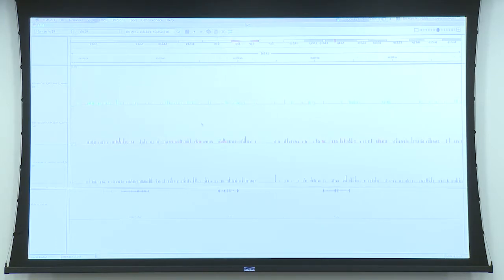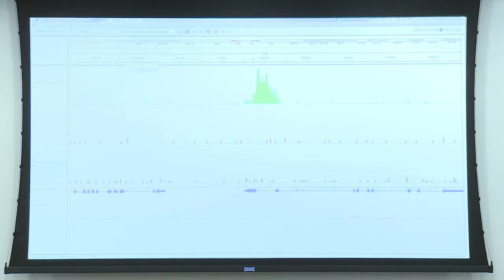So for instance, if I want to zoom out, I click together with Alt. You can also use the plus and minus, of course, but clicking Alt makes you zoom out. And then imagine that I want to decide what's the size of this peak. So you can click on this one, which tells you to define a region of interest.